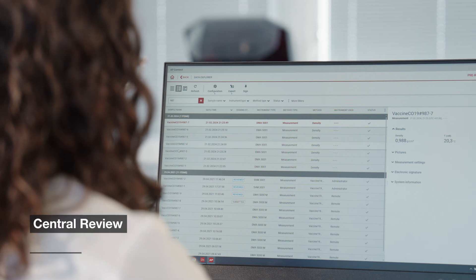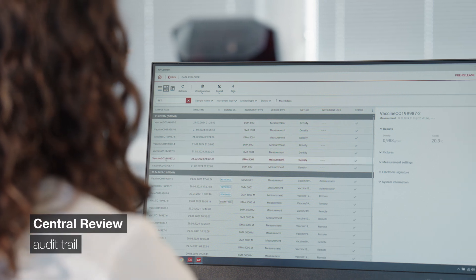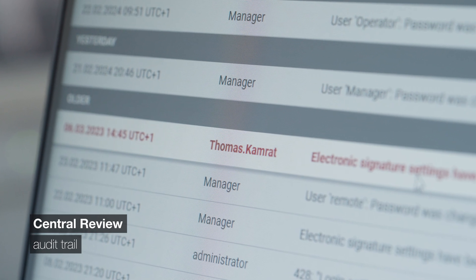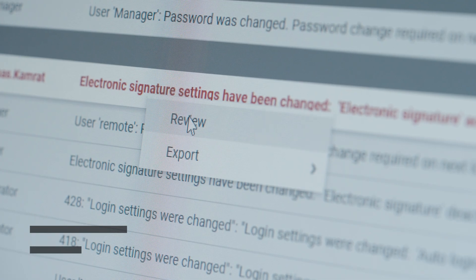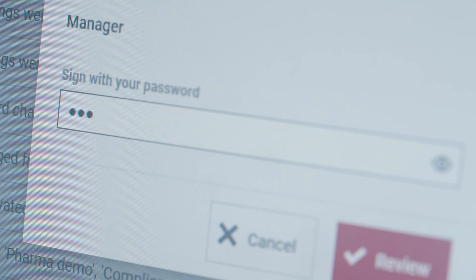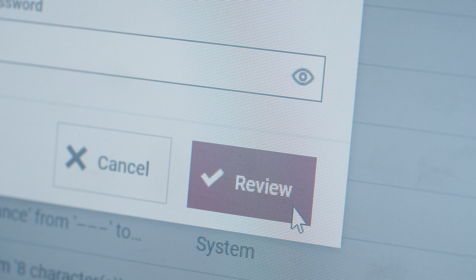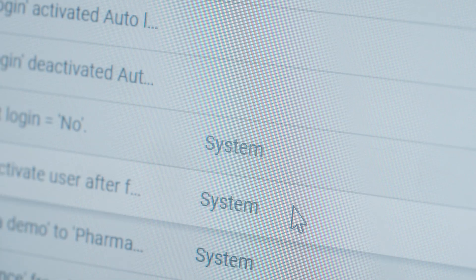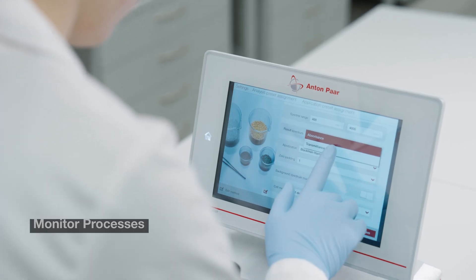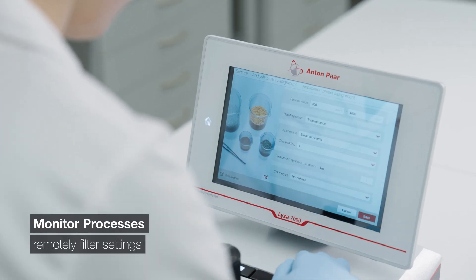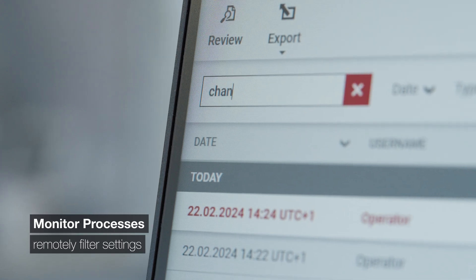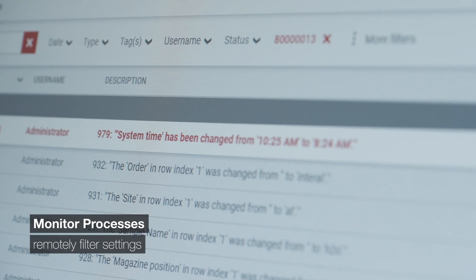Ensure traceability with central review and approval of measurements. Establish a centralized audit trail so you're prepared for any questions. Monitor your processes and remotely filter for each instrument setting.